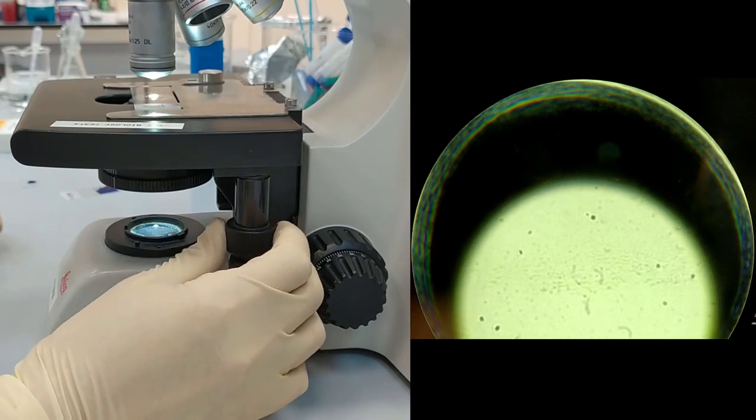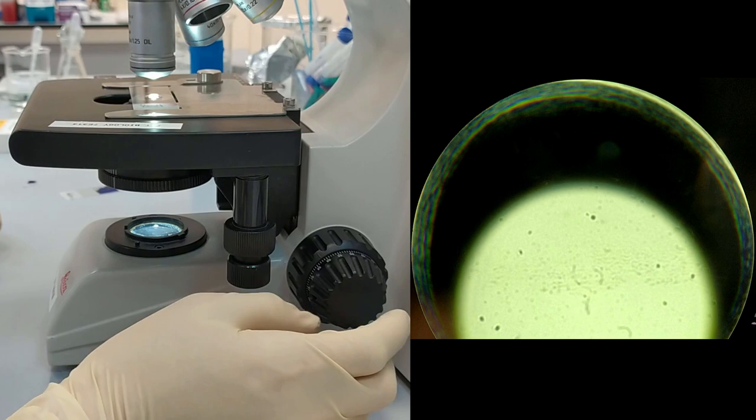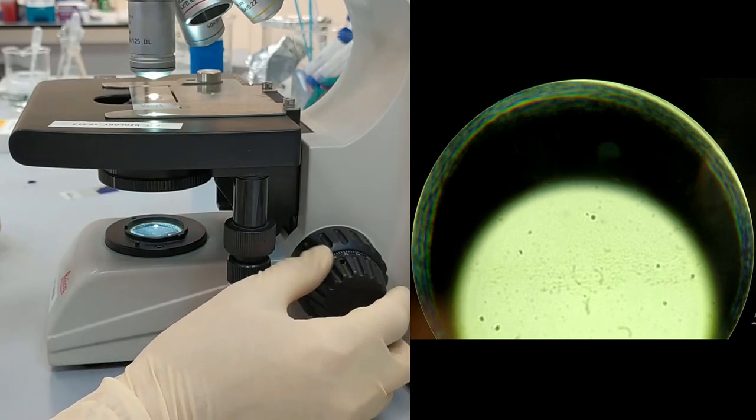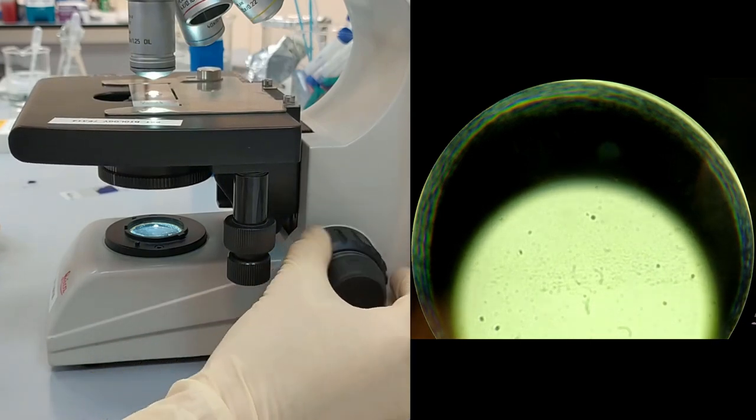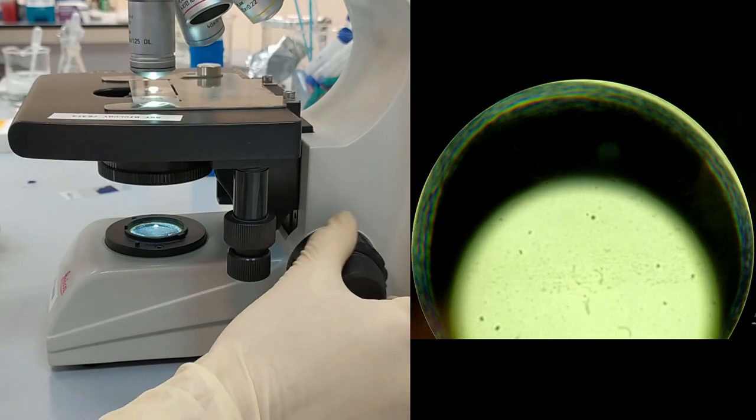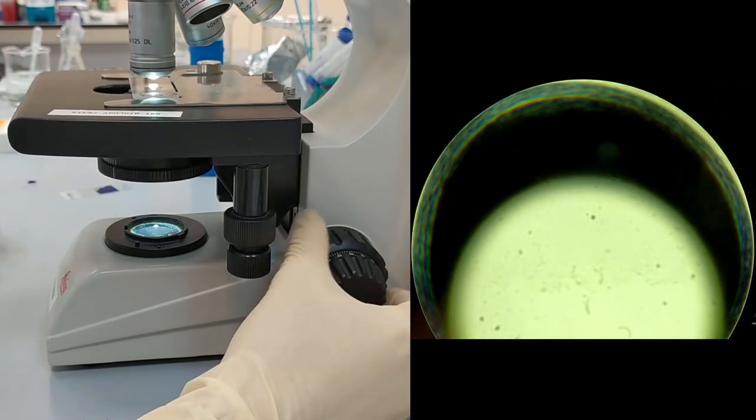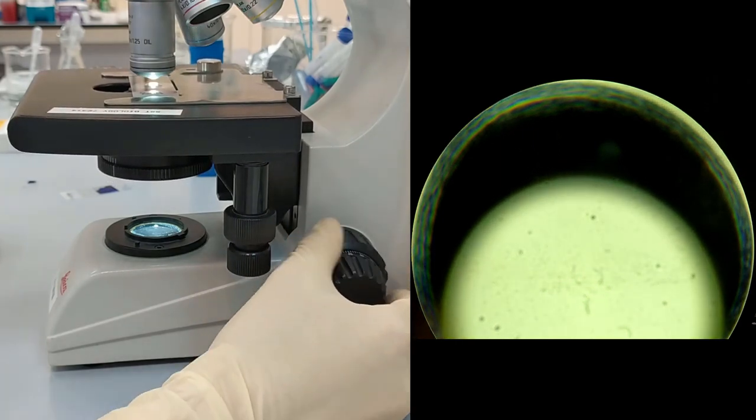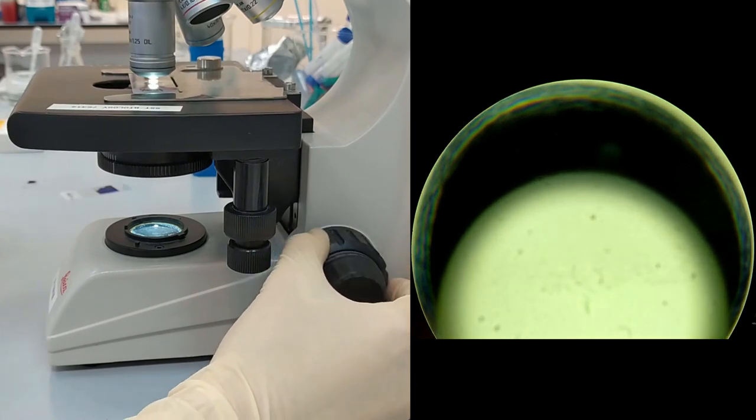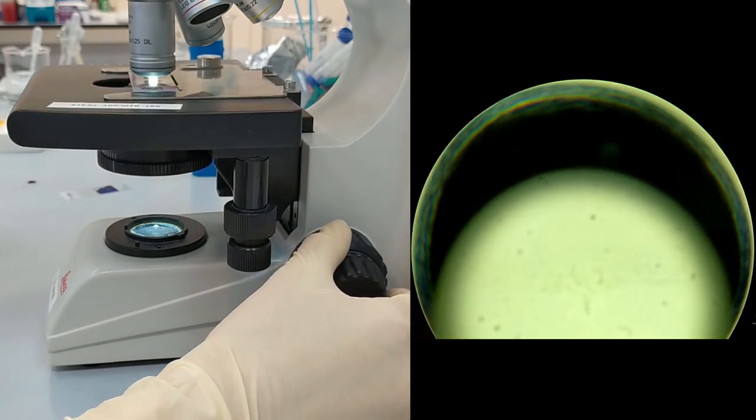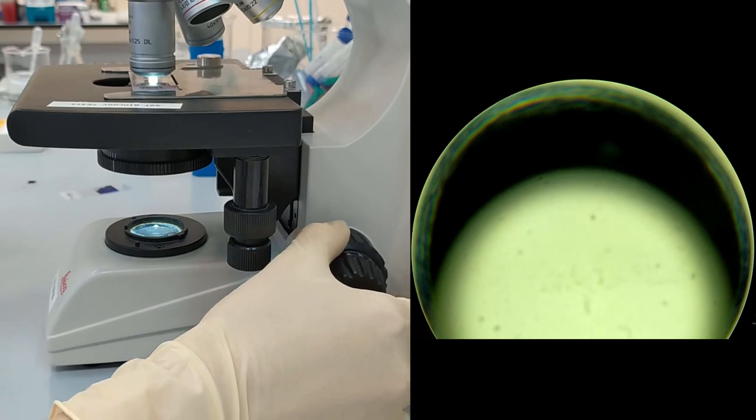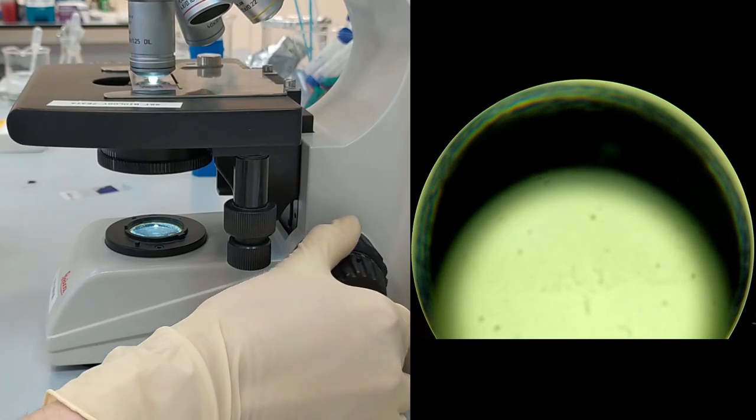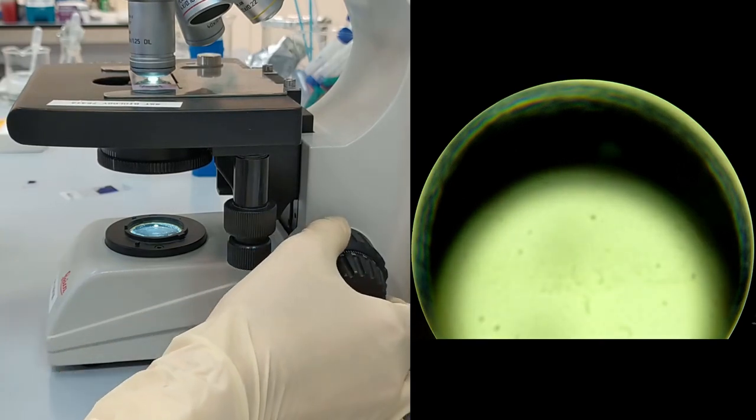Then we place the drop right beneath the objective. And under the control of eyes, we start rotating the big knob until we see the clear touching of the surface of the oil with the objective. You could clearly see that, like here.